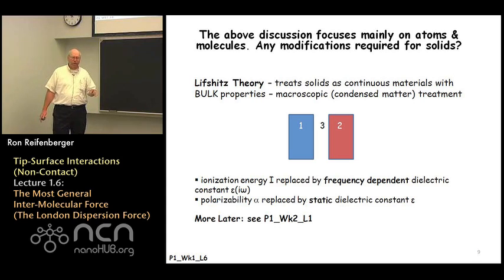There's a very nice theory that's been developed by Lifshitz. In the Lifshitz theory, the parameters of polarizability and ionization potential energy are replaced by dielectric properties of solids that develop when atoms all condense and form a periodic solid.